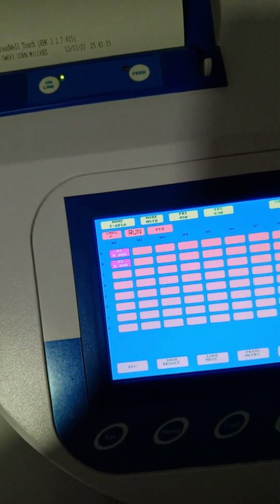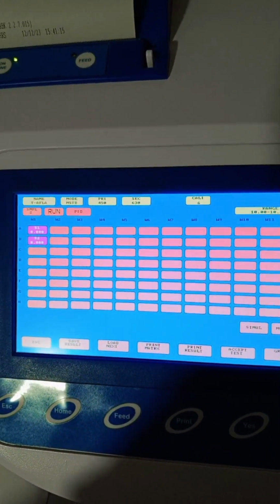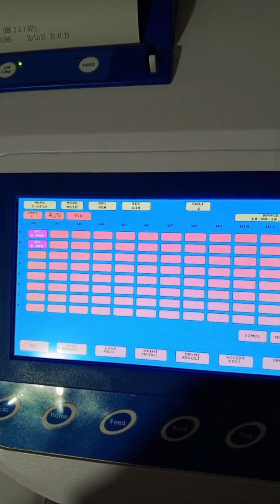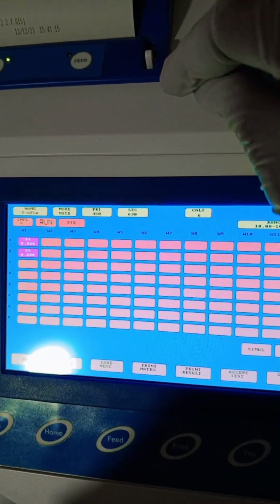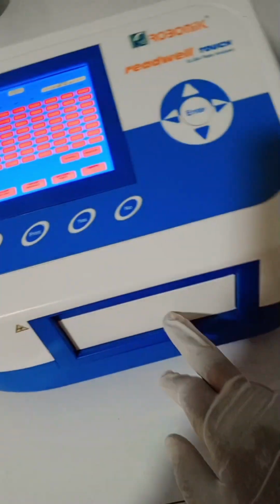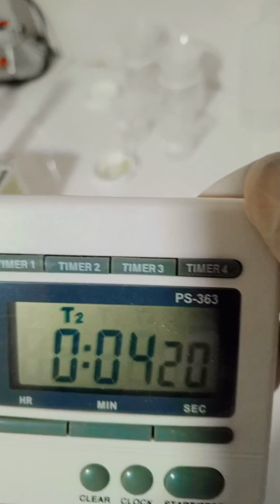Actually, at this point I was doing analysis for the flour. Yeah, I think I've given you the clue. I was doing analysis for the flour. Now when the time elapses during the incubation and finishing with the stop solution, washing it, also adding the substrate, you do what, you run.